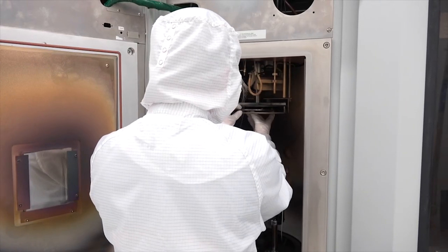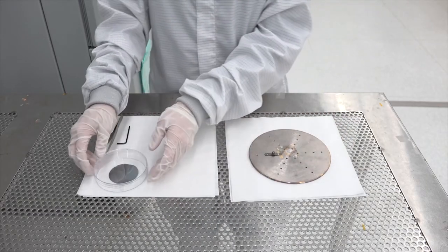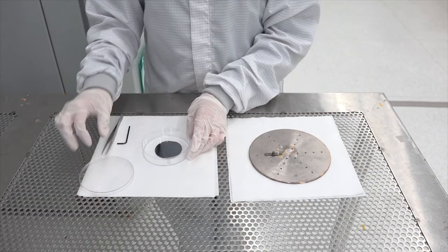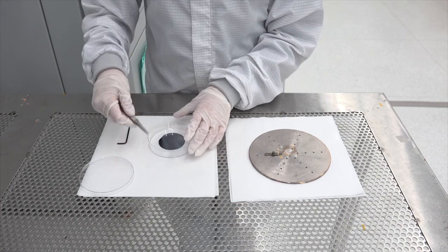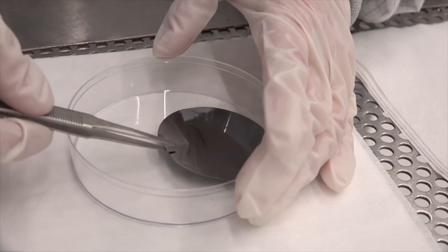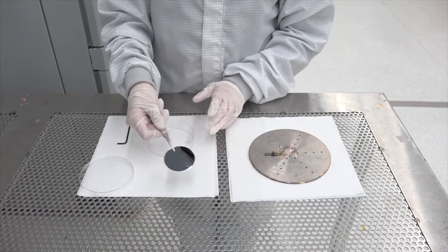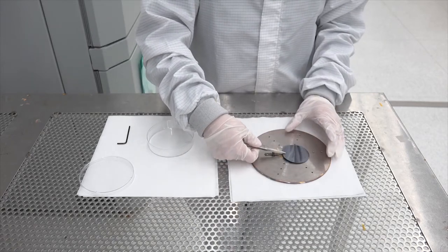First, we remove the metal plate from the chamber. Let's load our substrate into the vacuum chamber so we can deposit a thin film of titanium onto it. This is the silicon wafer we will use. Notice the color. This is pure silicon. Today we will deposit a thin film of titanium onto the silicon.